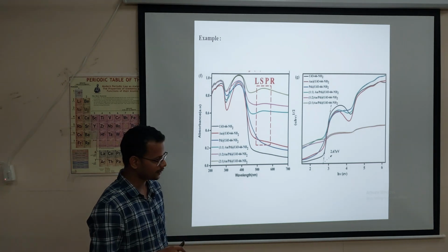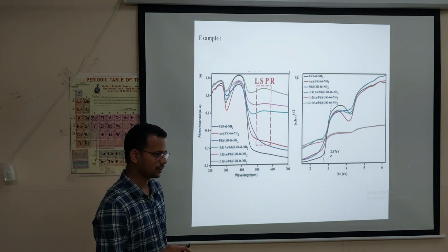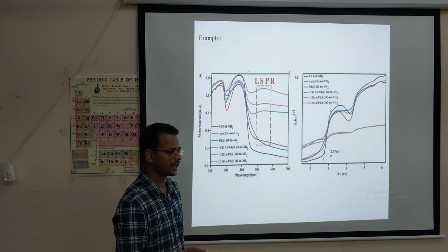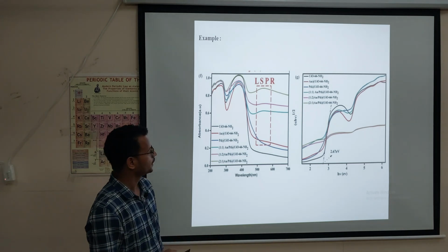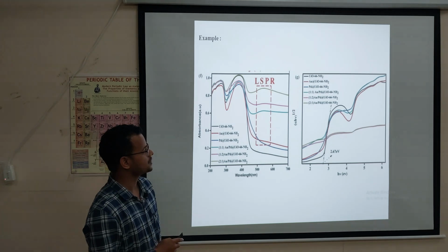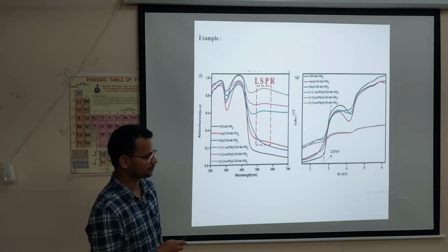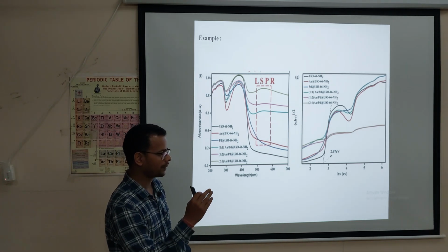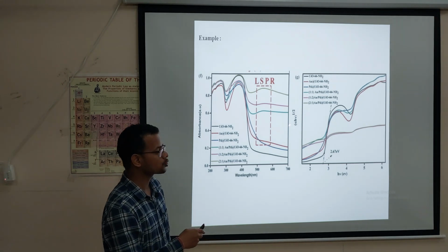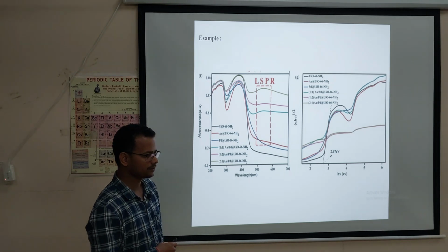100%. I will tell you. I will tell you that one. Yes. What is red shift, what is hypsochromic, bathochromic, hypo, I will tell you that one. Okay, you just wait. So, okay, it is our indirect band gap. You know, here 1/2 is there, na? Here alpha h nu to the power 1/2, it matches with indirect band gap. It shows indirect band gap, not direct. If it is whole, meaning 2, then it will be the Tauc plot. Okay, clear?